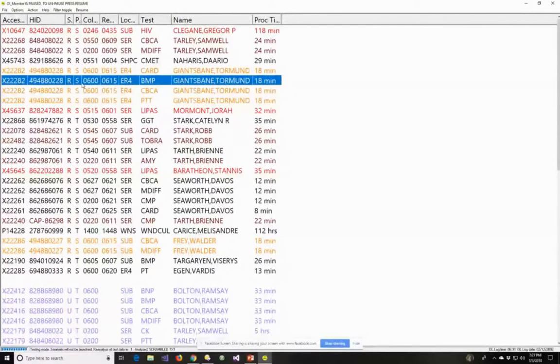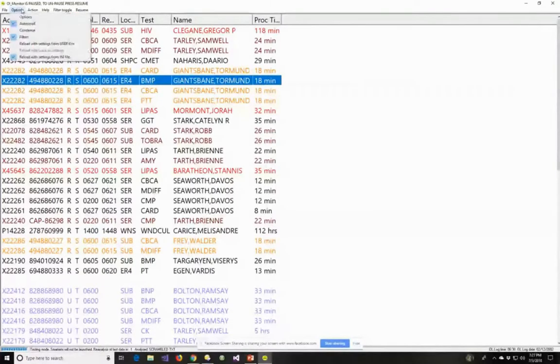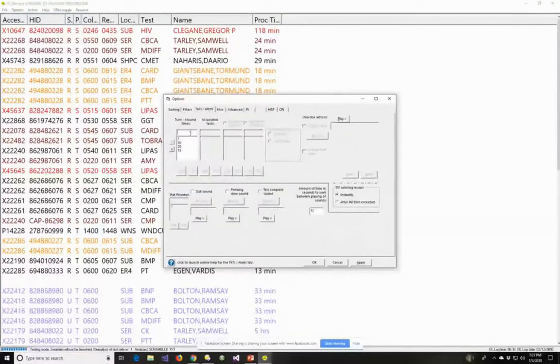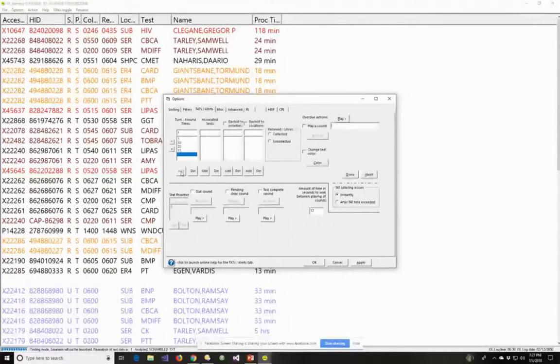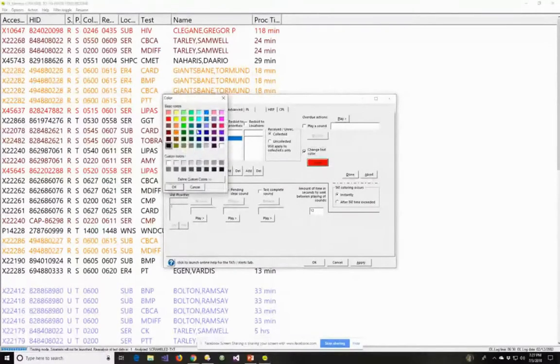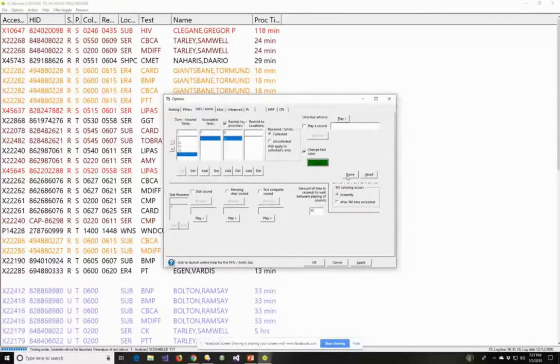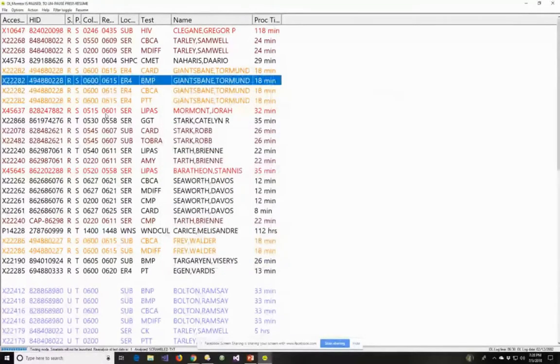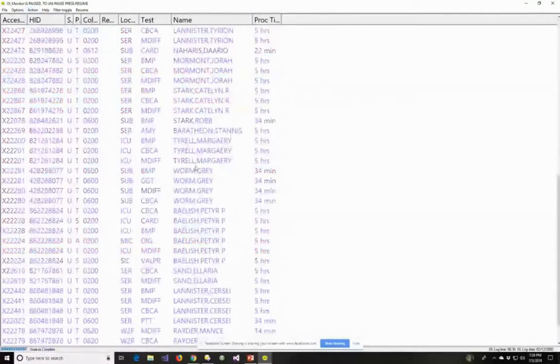Another thing we can do is always have our stats be a different color than our other tests. Let's do another one-minute rule — as soon as stats hit the door, we know they need priority. Let's make them a dark green. So this is going to be kind of a red light, green light go kind of thing. We would do yellow, but it doesn't look good on a white background — that's why I did orange instead.